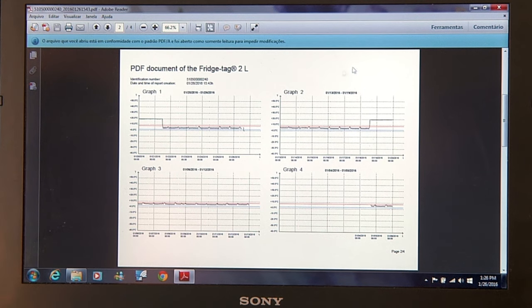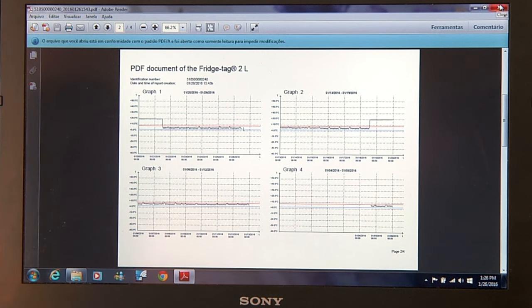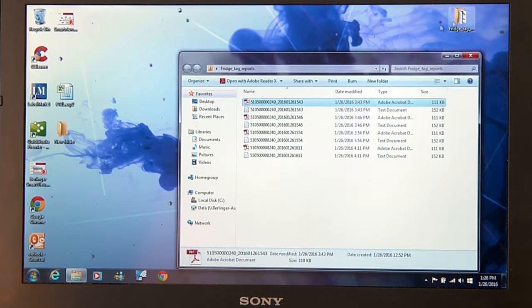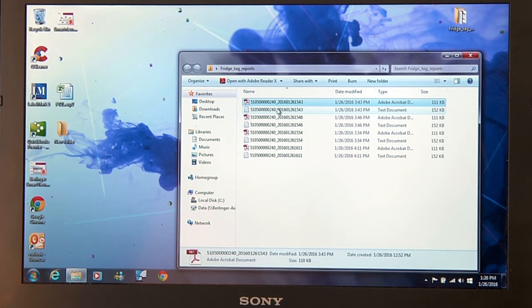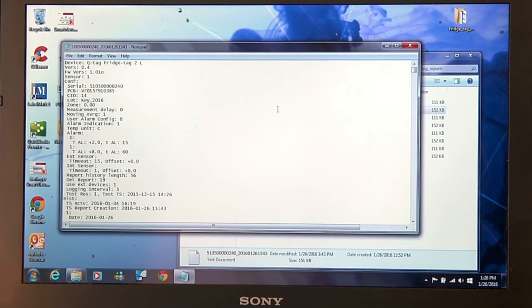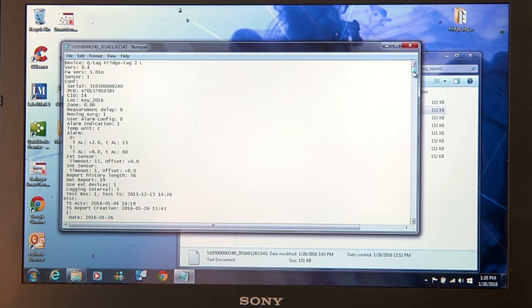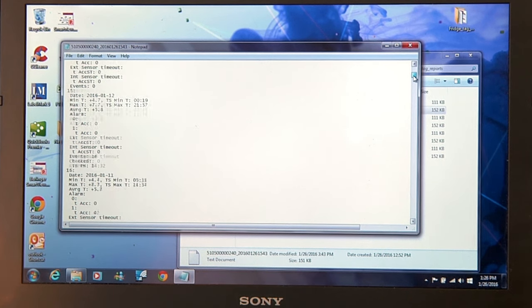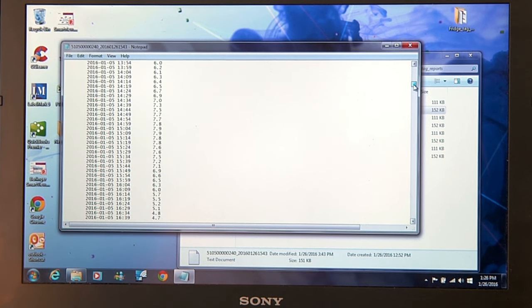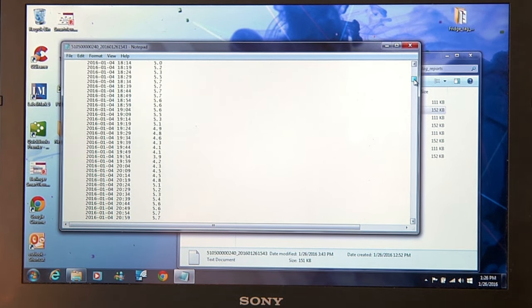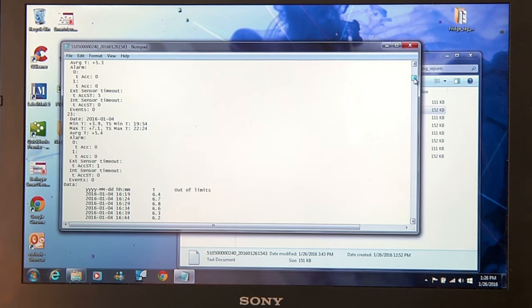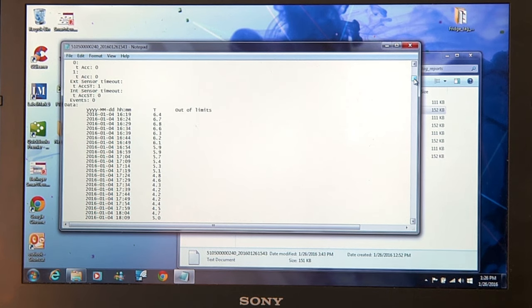And if you need more data, close the PDF report and open the TXT report. When you grab the right-hand side and scroll down on the TXT report, you'll see that you come to the daily temperature readings.